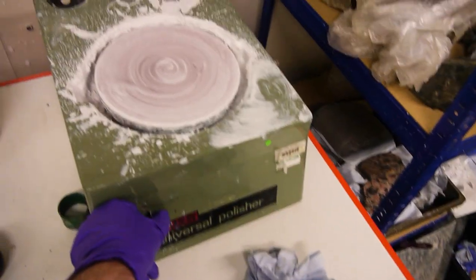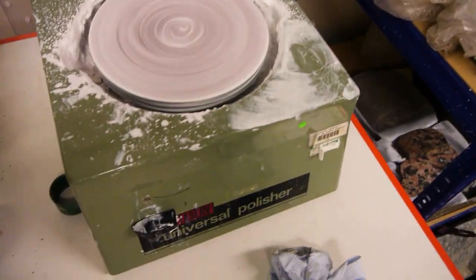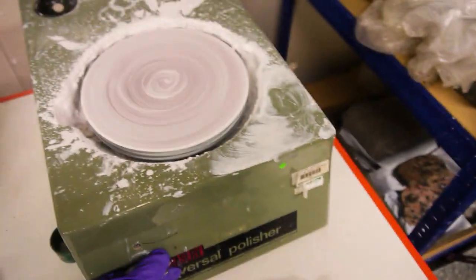This one is an alumina lapping wheel — pop some of the alumina fluid on it and then polish your rock on there. I really enjoy it. Just so you don't think I'm exaggerating about how loud the extract fan is, check this out — that's really, really loud. It sucks all of the air and the dust out so that we don't get dust, because some rocks contain things like asbestos and you don't want to breathe in asbestos.